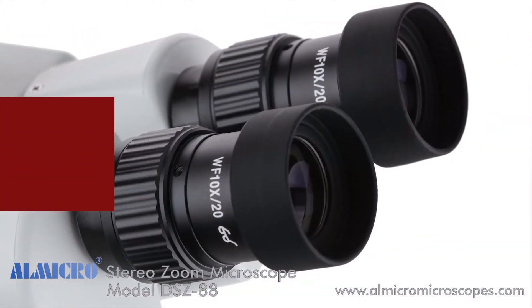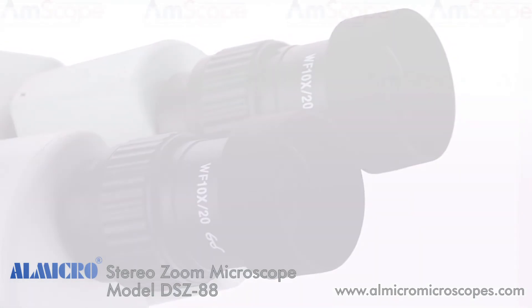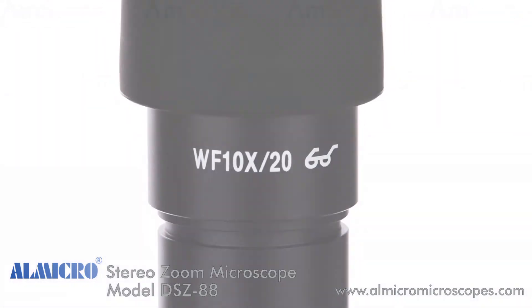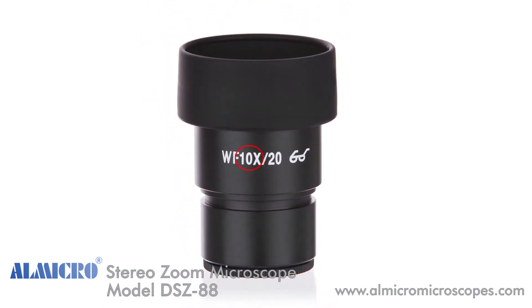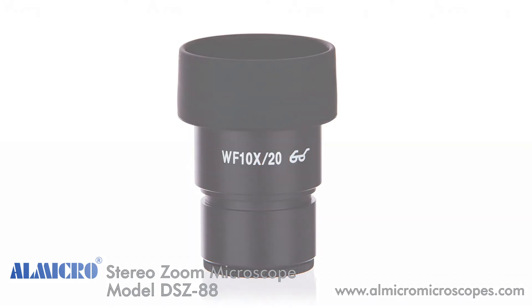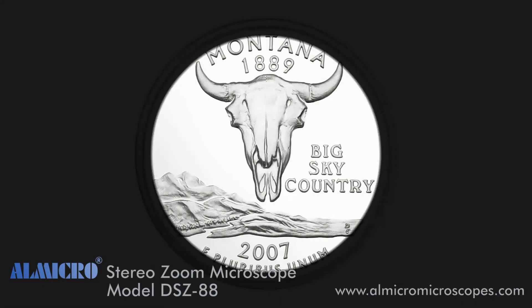Field of view is a measurement of the sample area that is visible through the microscope. Your eyepieces will be marked with two numbers: the first is the eyepiece magnification, and the second is the field number, which represents the eyepiece's field of view in millimeters. In cases where the objective lens produces an image circle smaller than the eyepiece's field number, that image circle would be the field of view.